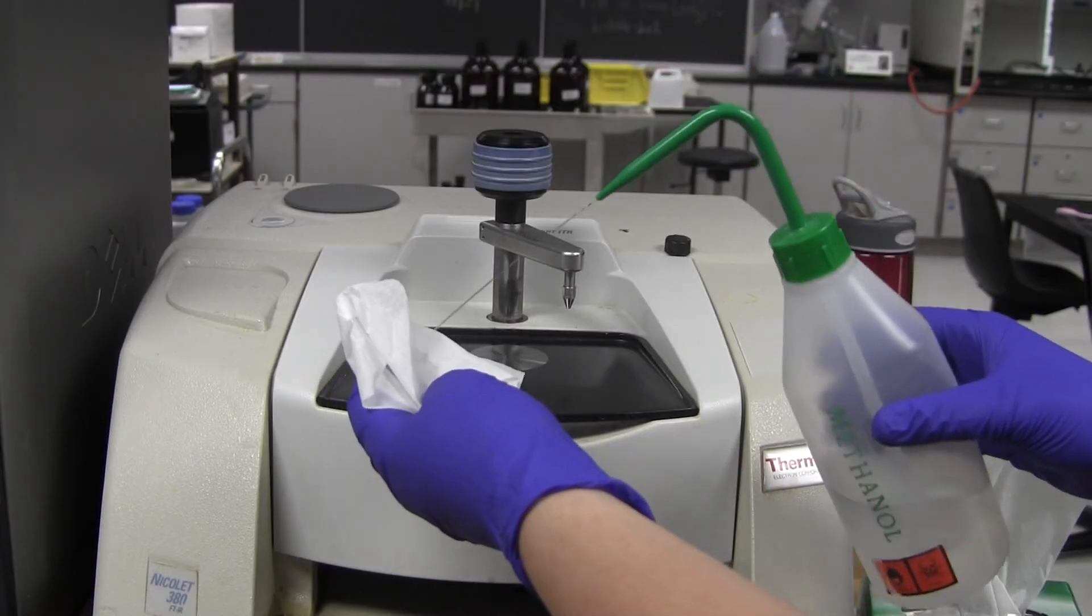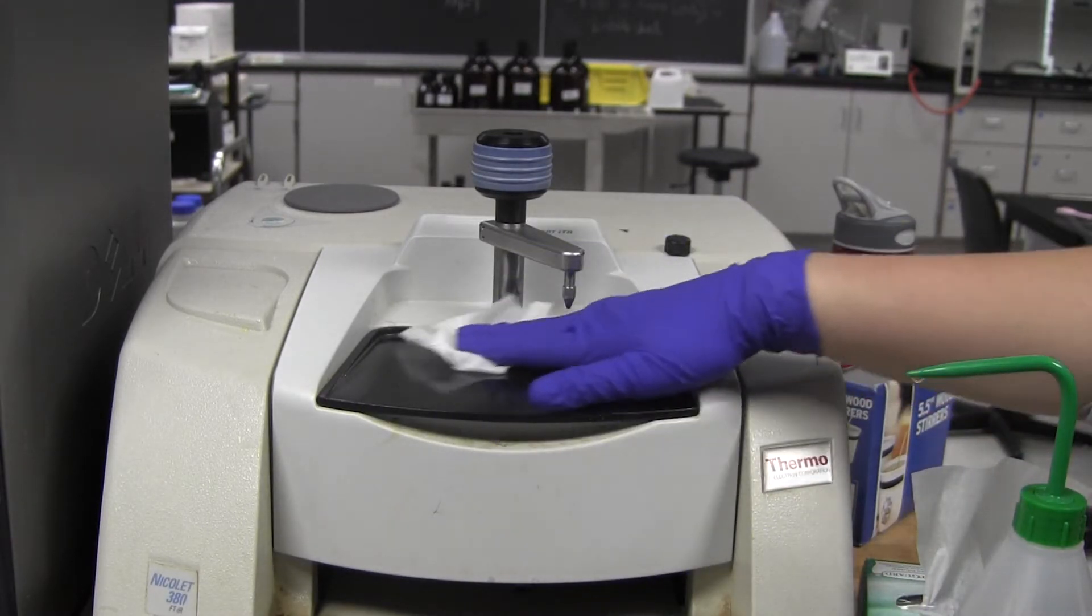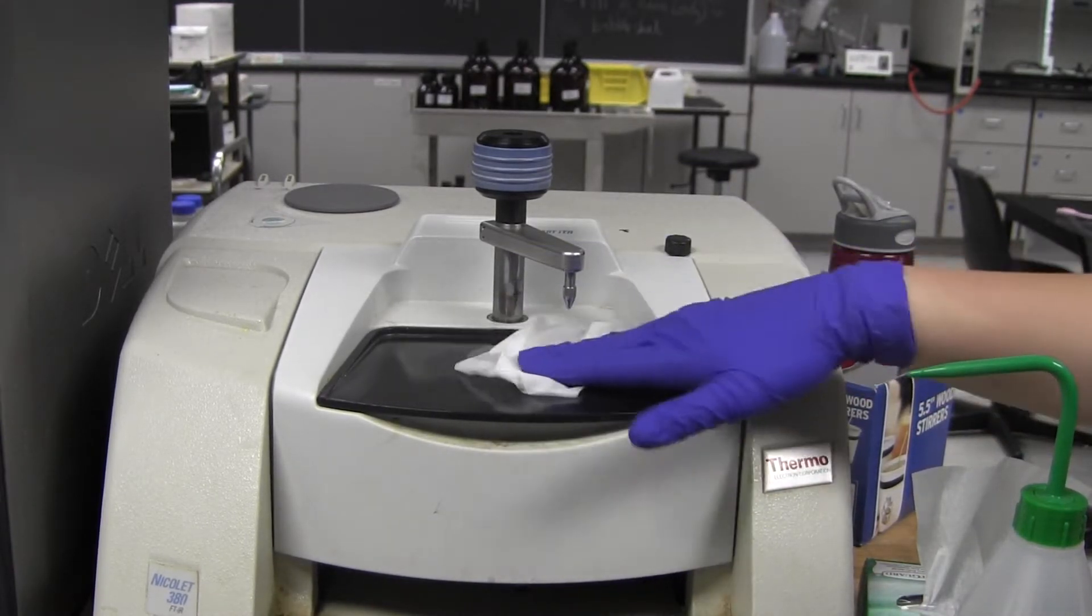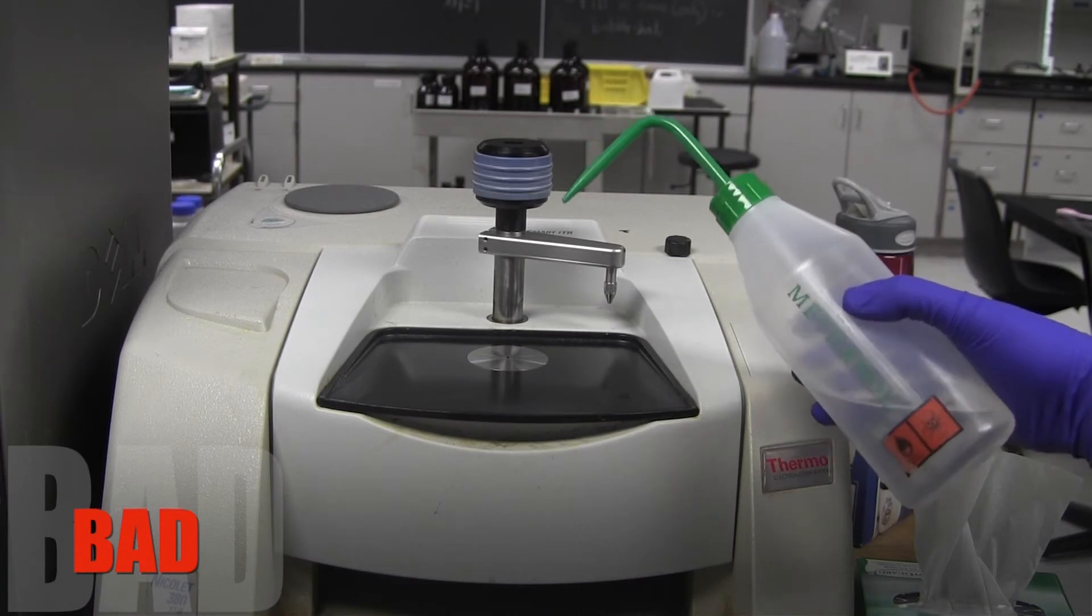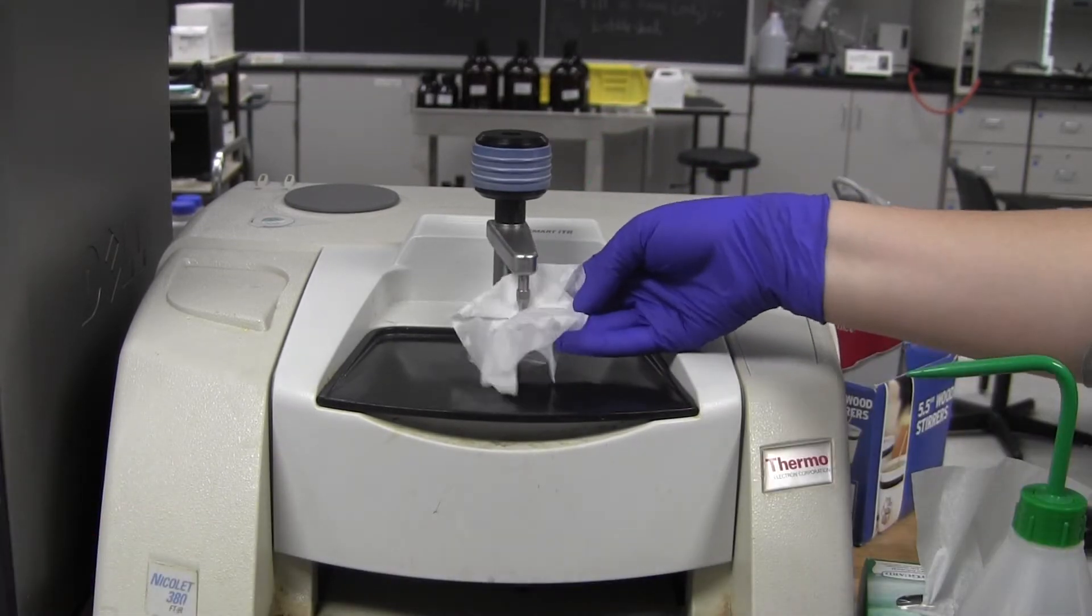First, make sure that the sample plate and crystal lens are clean. If not, squirt some methanol on a tissue and wipe the area clean. Never squirt methanol directly onto the crystal. It will ruin the machine. Be sure to clean the end of the arm as well.